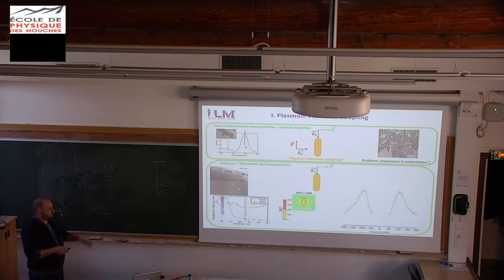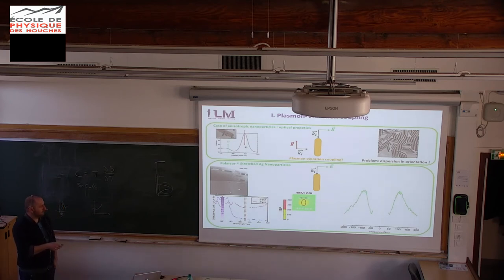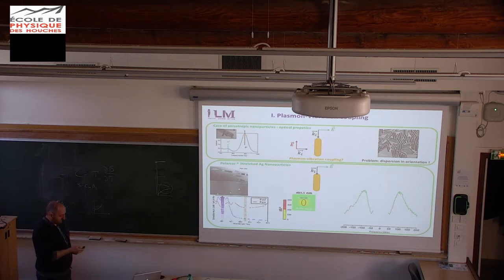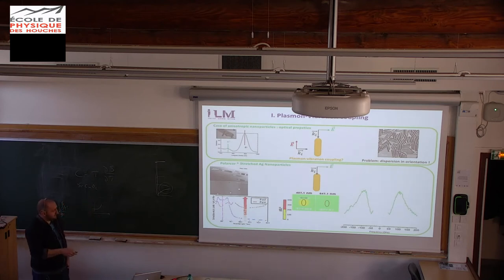And we make the Raman spectra, controlling the polarization and the wavelength. So when we use wavelengths resonant with the transverse plasmon mode, with this polarization, we obtain this Raman spectra that gives us the size, the average diameter of the nanorod. So it's fine, it's about 10 nanometers here. And if we change wavelengths with the same polarization, you see there is almost nothing. We are not exciting anything. So we need the plasmon to observe something.